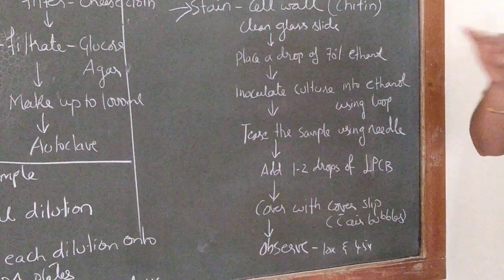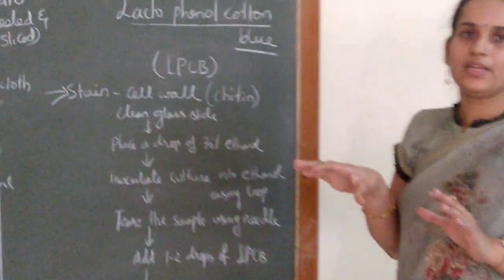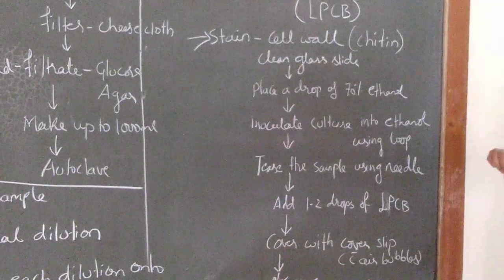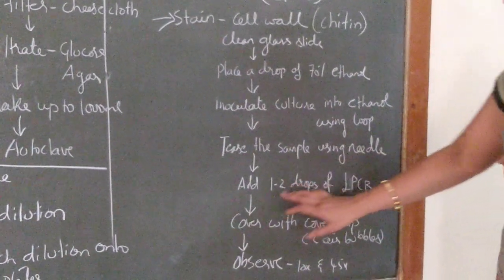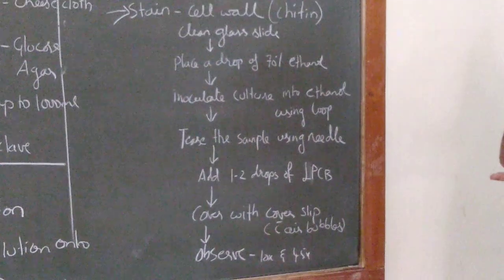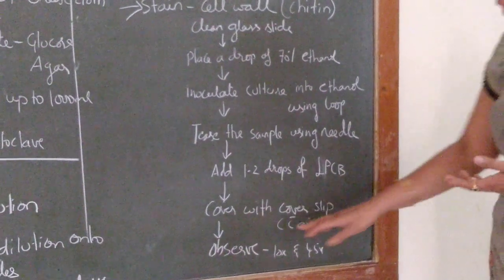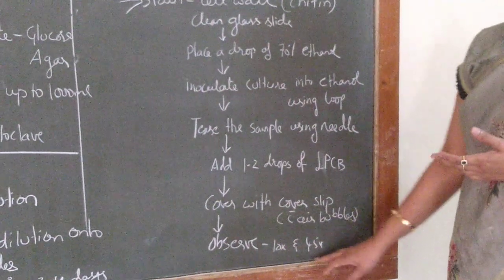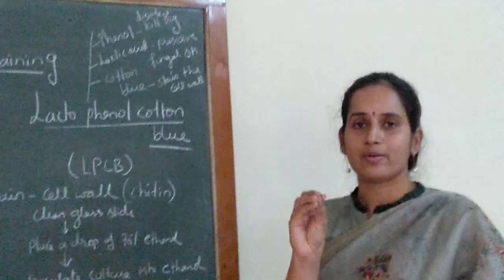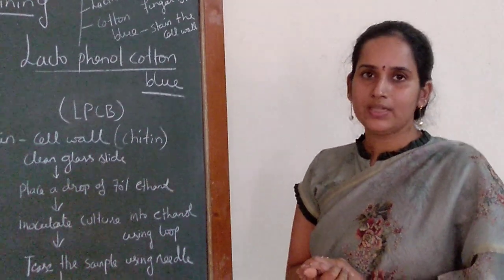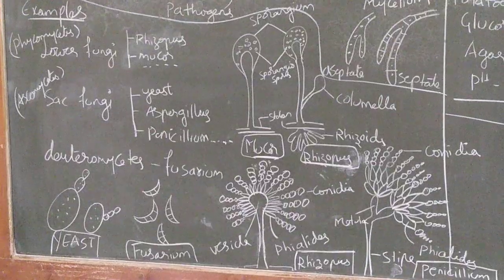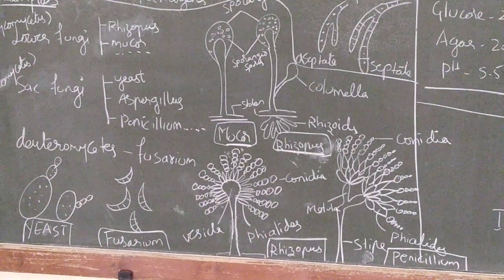Tease the sample using a needle to spread out the cottony growth or mycelium. Nicely tease out the mycelium on the glass slide. Then add one or two drops of lacto-phenol cotton blue and cover with a cover slip without any air bubbles. Observe immediately under the microscope at 10x as well as 45x. The fungal structures will be stained dark blue and the background will be light blue. Based on the specific structures, you can identify which fungal species is present.